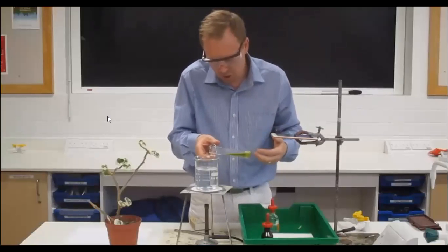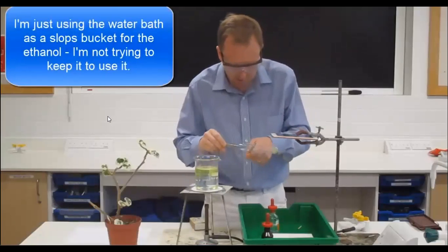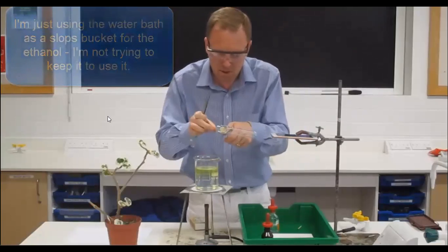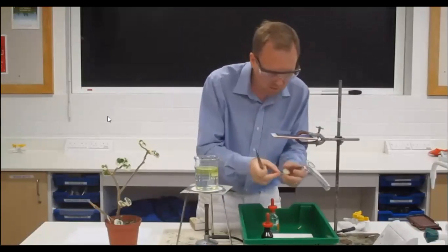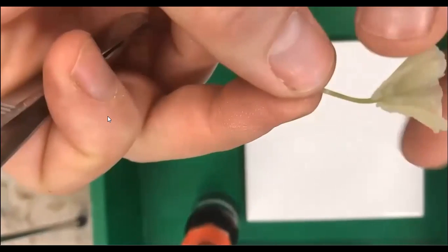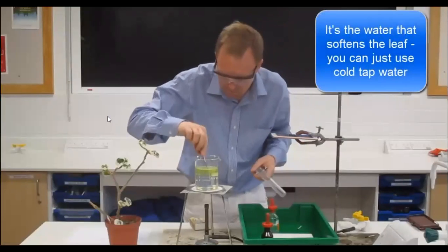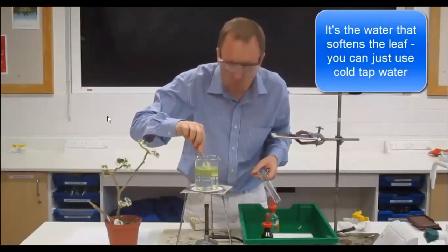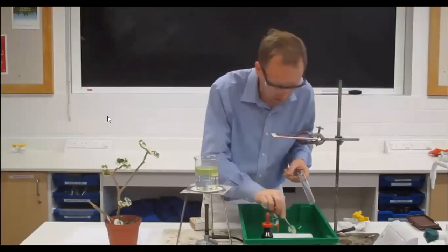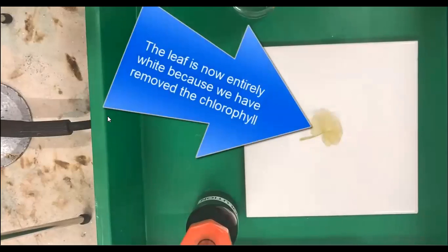The leaf, well, I'll show you first before I pour it in. It's going to come out all kind of crispy. It's rather peculiar. Out it comes. It's all kind of crispy. It's not floppy at all. So we're going to drop it into here. That'll soften the leaf up. Because we need it soft, we're going to need to spread it out onto our white tile in order to look for our results. There we go. We'll leave that in there.